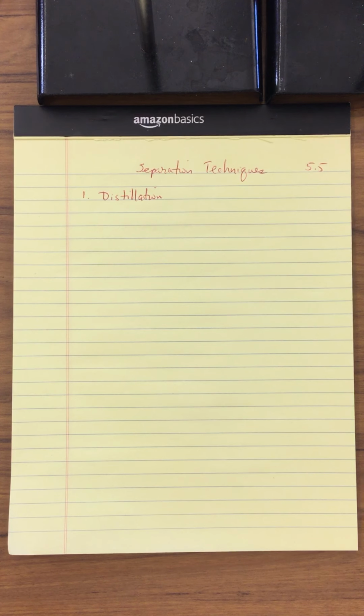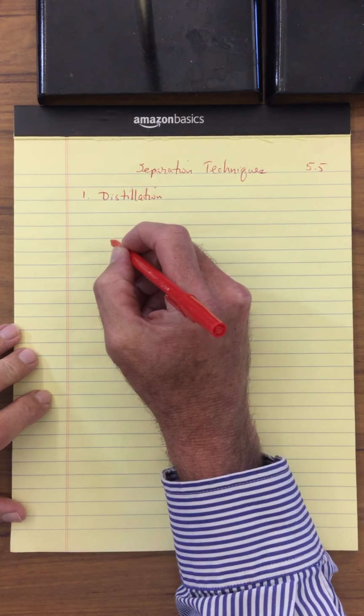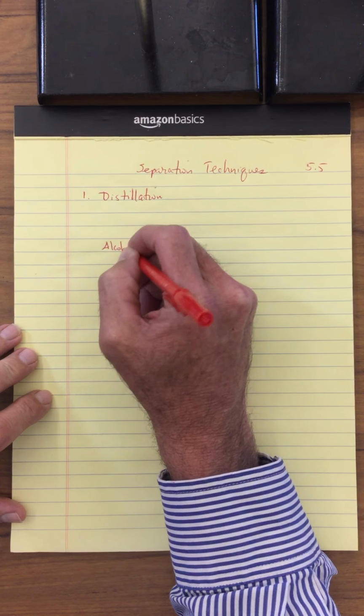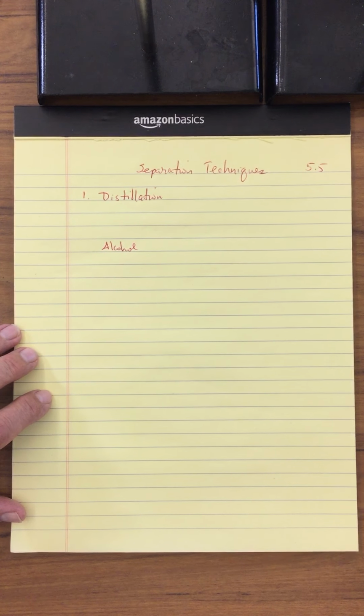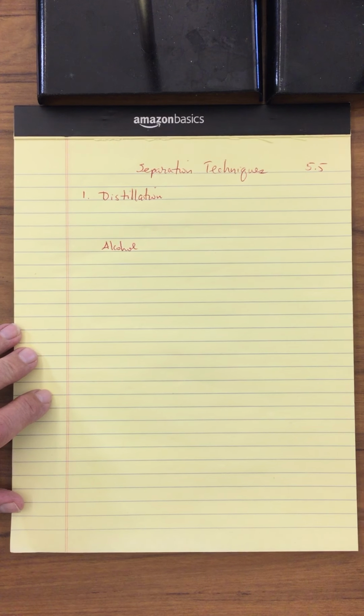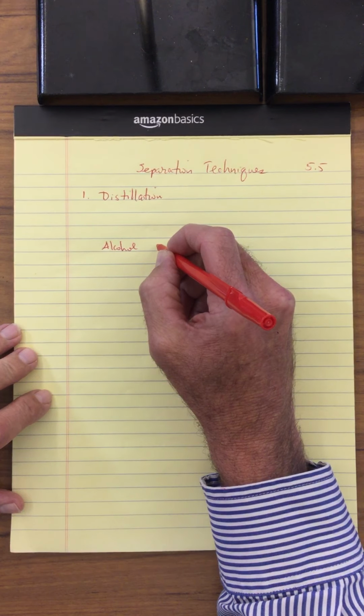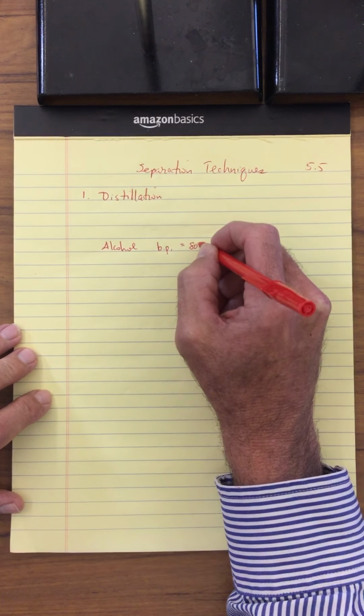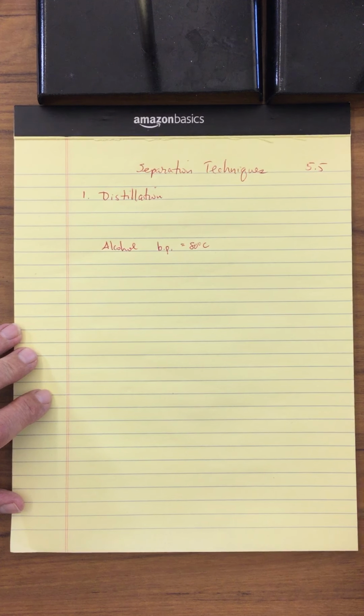So we'll get to the actual name of this, but I first want to imagine that you have a combination of alcohol and water. Let's just say it's rubbing alcohol, because I think that's what we're going to be using in our lab. So you have some form of rubbing alcohol, and a lot of the alcohols have a boiling point of around 80 degrees Celsius. So I'm going to put BP for boiling point equals 80 degrees Celsius.